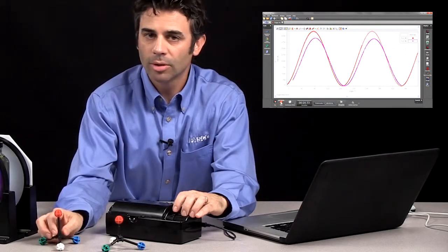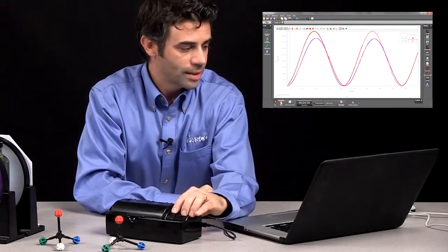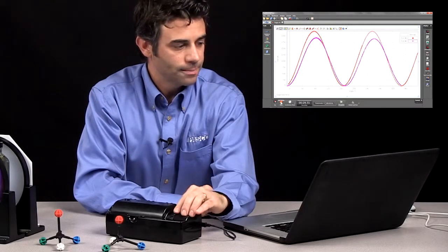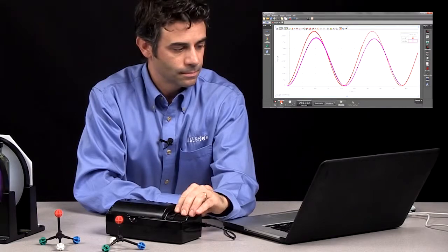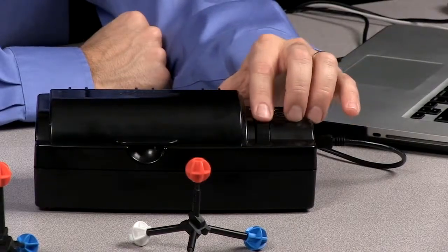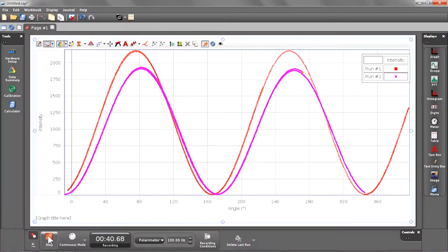Because, just like this, there is an optically active chiral compound in there that will shift that polarizing, the plane polarized light. So I'll spin this around a little bit. The wheel on here has a notch in it, so you know where you start and end to make sure you're going around at least once.